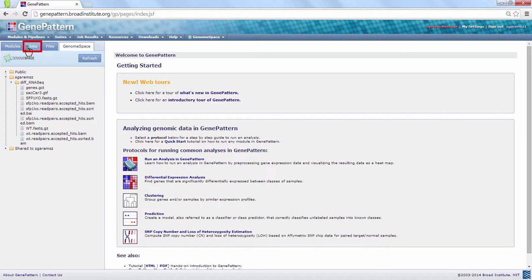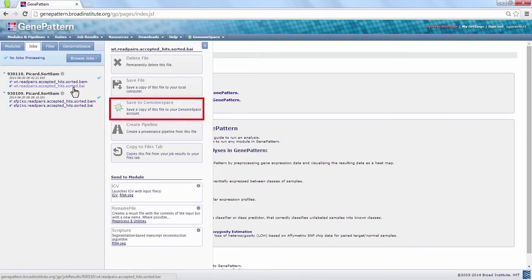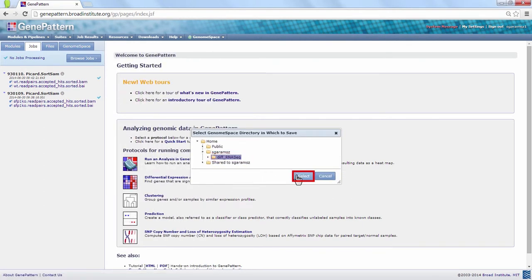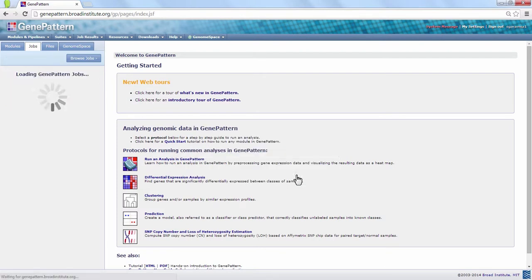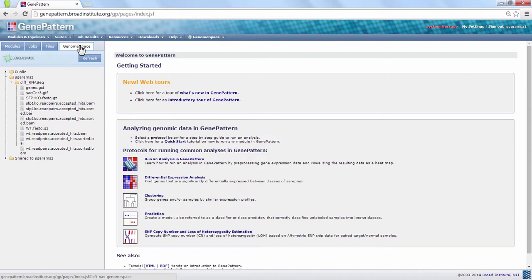Again, navigate back to the job to save the BAI file. Click the GenomeSpace tab to check that your files have been successfully transferred.